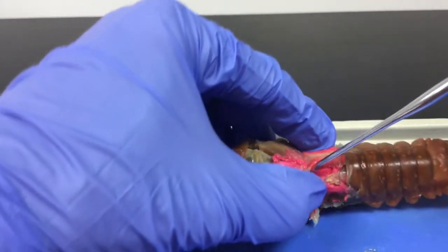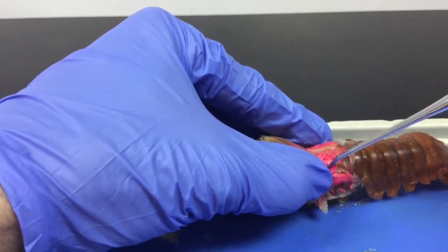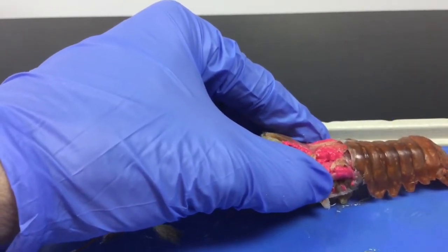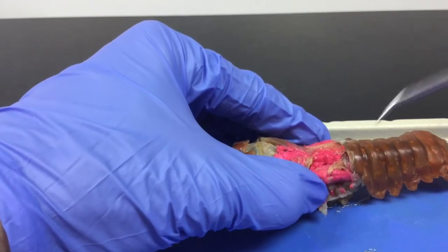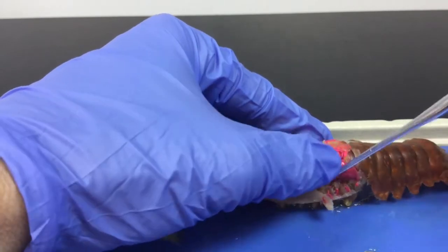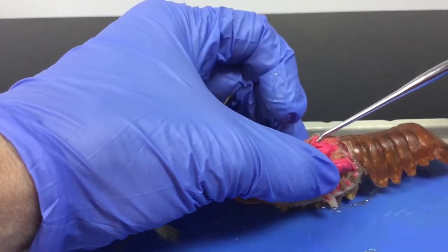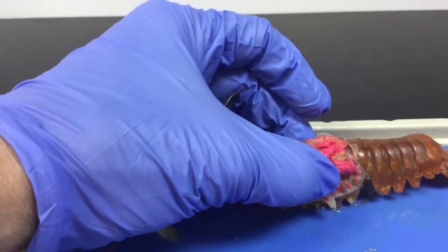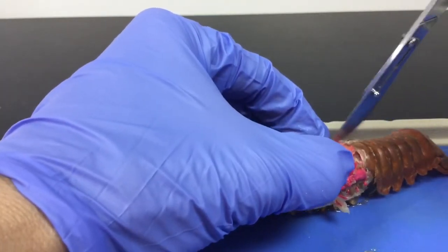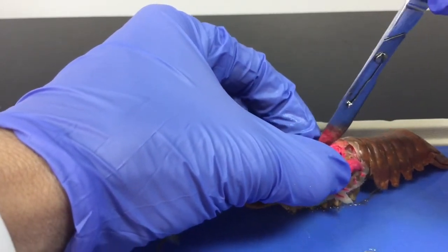I think my hand is probably in the way. Now I have a question for you. The mid-dorsal heart. Owen, maybe you can answer this. The crayfish actually relies on gravity to spread its nutrients throughout its body since it's an open circulatory system. So why would being on its back be lethal to the crayfish? Because the heart is near the bottom. Gravity can't help it. Yeah, if it's on its back, then the heart's on the bottom, so the blood's not going to go to the rest of the tissues.